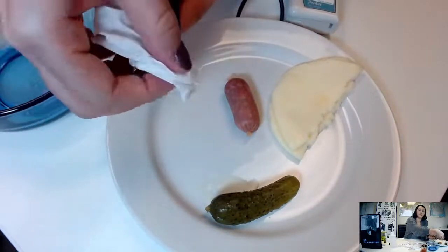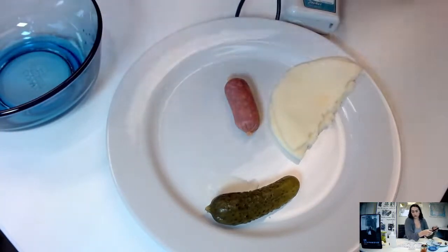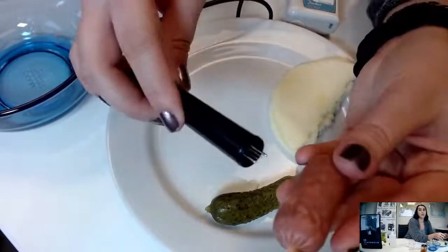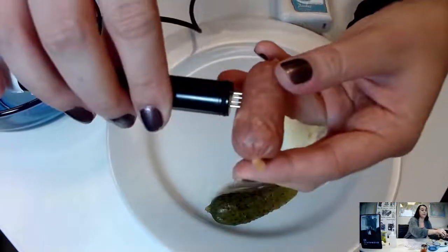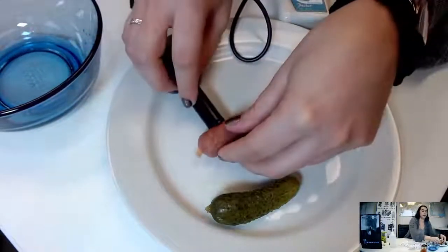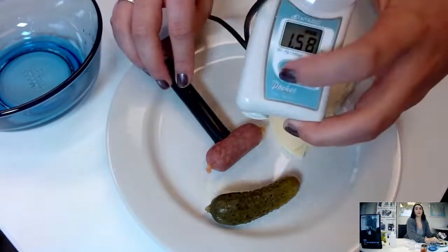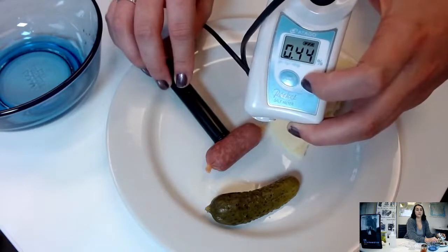again. Okay. Just like that. And we'll do the sausage next. So the same thing, the sausage is a little cold, it was in the fridge, so you're just gonna gently insert, let me see, gently insert the prongs into the sausage, just like that. Make sure they're in there completely, just like that. And then we're gonna press the start button. Okay, 0.44.